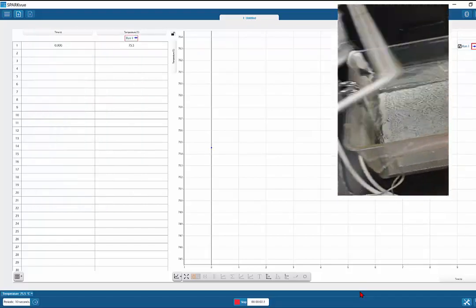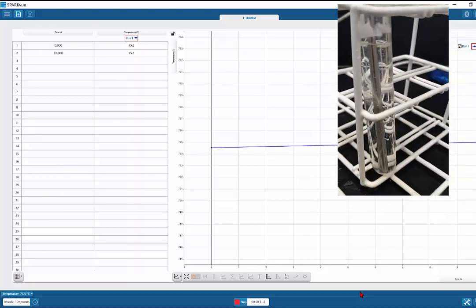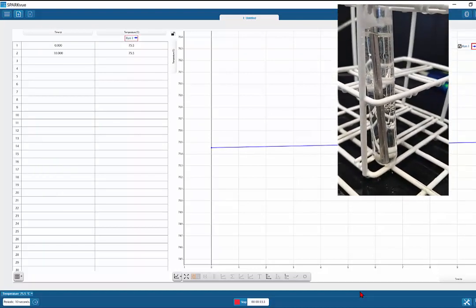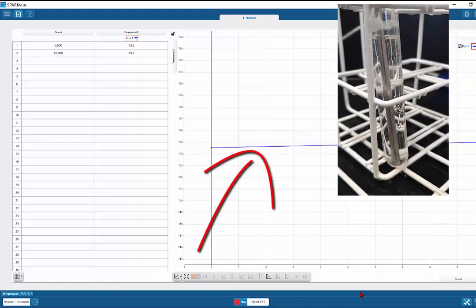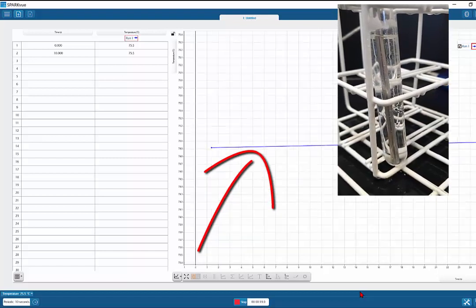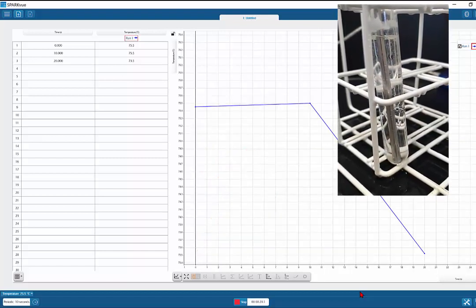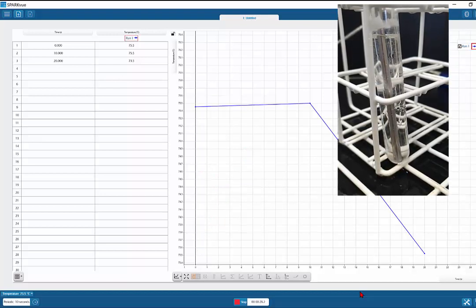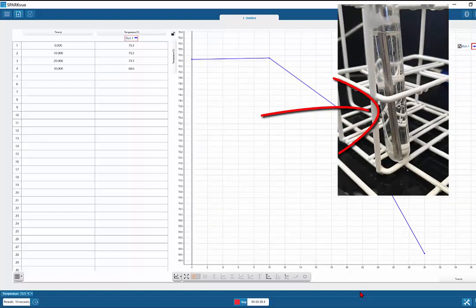Okay, so first of all, you put the data logger in and let it sit to get that nice even temperature there, and you can see it's a liquid here. And so what's going on is this thing is beginning to cool down. So if we start this reaction here, you can see it's quite clear. So it's a liquid. So we're going from liquid to solid. So right now the liquid is just cooling down.